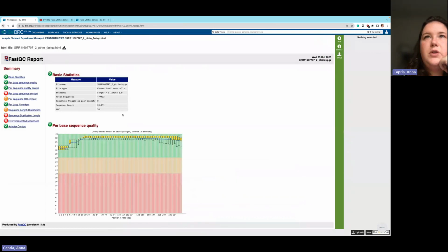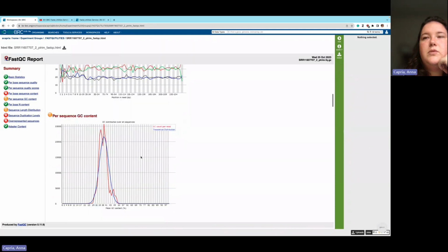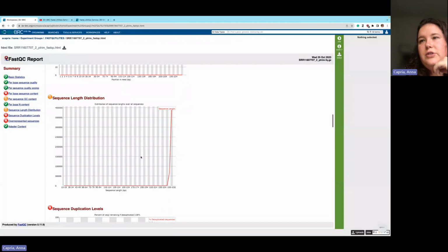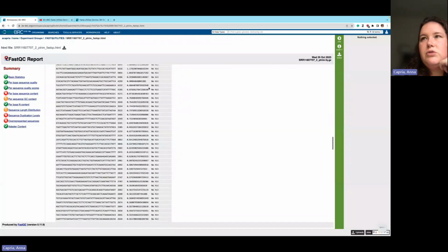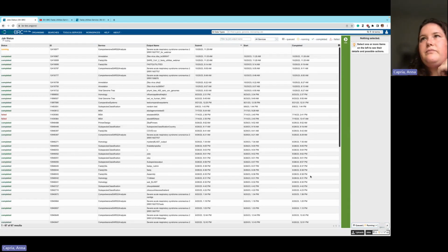Then you can do the QC report, showing quality, GC count. Just depending on what you're interested in, you have these to use. And again, the different files, unzipped or zipped. So that's the standard output for a FASTQ utility. And the exact information would be different depending on the order you took those steps in. Glad to introduce you to that.